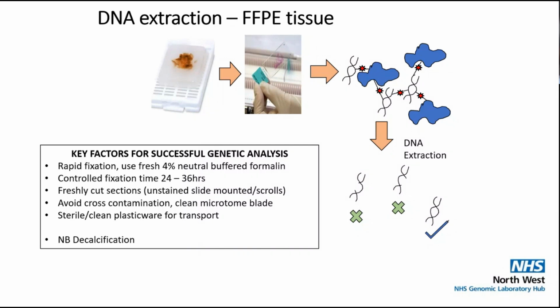And so to avoid that cross-contamination, we're looking at working in a clean area with clean microtomes and sterile, clean plasticware for transport. Just a little note about decalcification. We know there are often samples which need to undergo decalcification. We just would like to mention that acid decalcification is very degrading to the DNA, and we can very rarely extract DNA which is suitable for analysis if the sample has undergone acid decalcification.